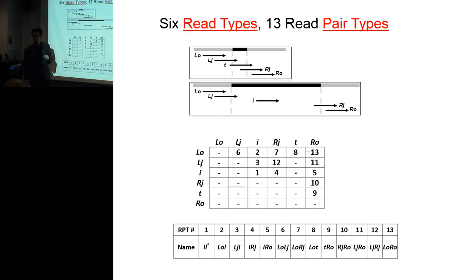Couldn't you, if you identify ones that have that repeat type, go back, since you have a very small set of potential locations, and actually map them with less than 20? Potentially, yes. Think about all the reads. If you did whole genome sequencing, you really rely on these uniquely mapped ones to gather what we call a read set, a local cluster of reads containing these ambiguous portions that have problematic mapping.